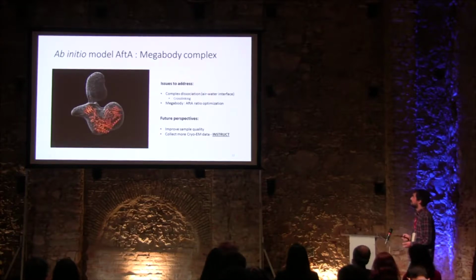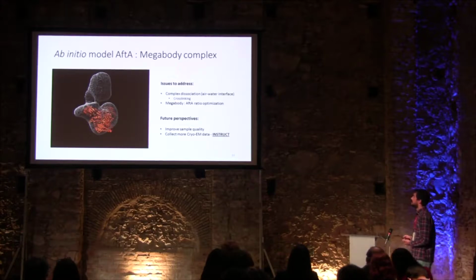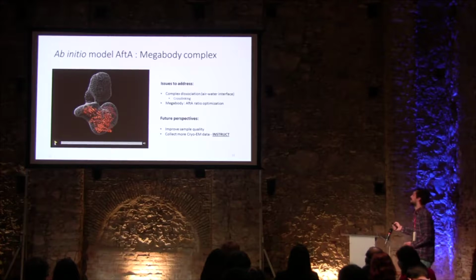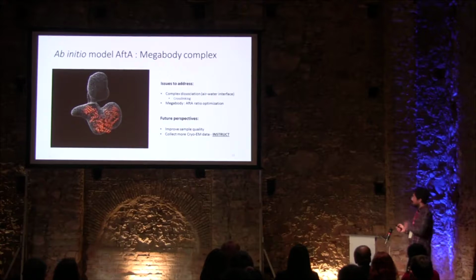However, we could fit the megabody PDB that already is available. And as you can see, it fits well in the boat-shaped density. People can see it, and they will believe my word, because I'm looking at this thing a lot lately.